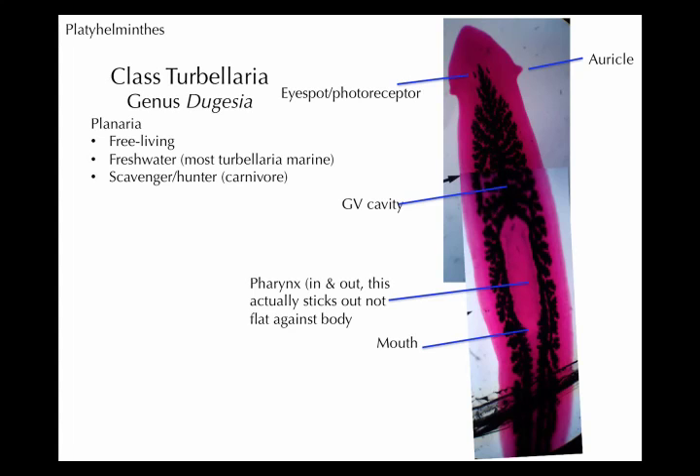There are some different features you need to notice about this Planarian. Starting at the anterior, we have these little protruding parts that look like ears — call those auricles, A-U-R-I-C-L-E. But they are not ears. The auricles are used for sensing molecules, like different chemicals, so that would be like our sense of smell. Their little auricles can detect smells.